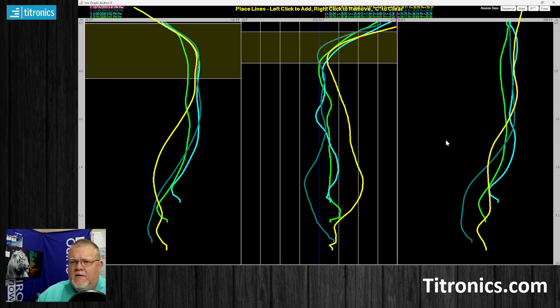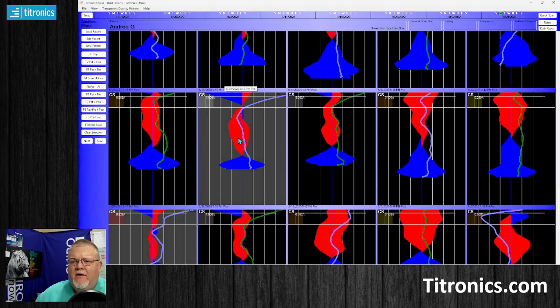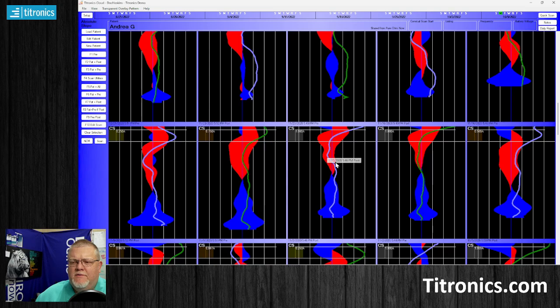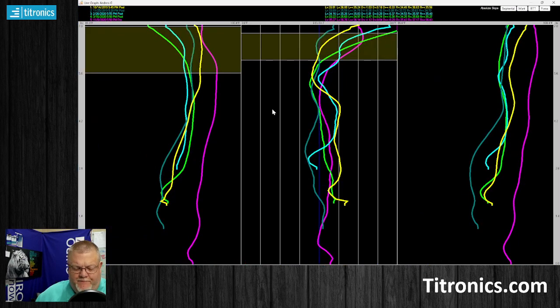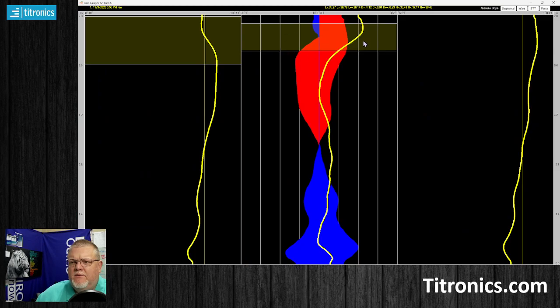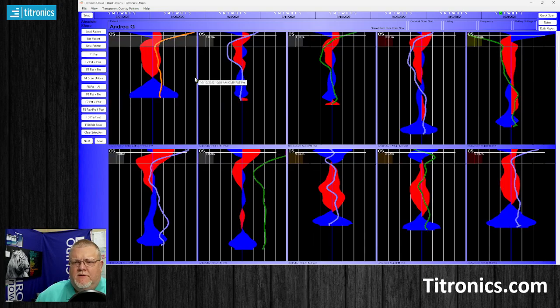And then I can click the make composite. And when I hit escape, it's going to save as pattern, but it's going to use my areas that I chose as the areas to compare. So I can take any of these, blow it up, take any of these and see where the area of pattern is. Now, I would also have to have selected this one as well.